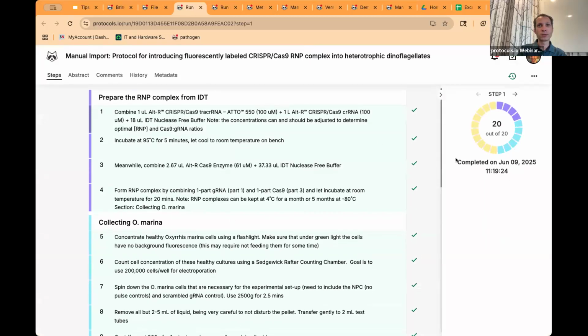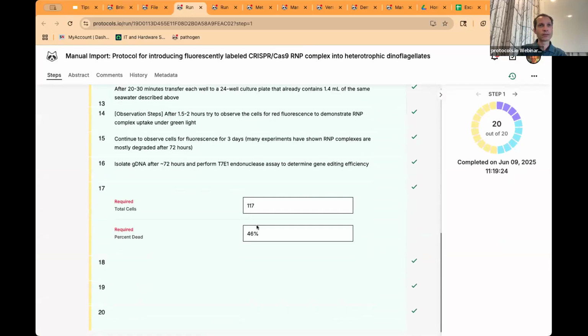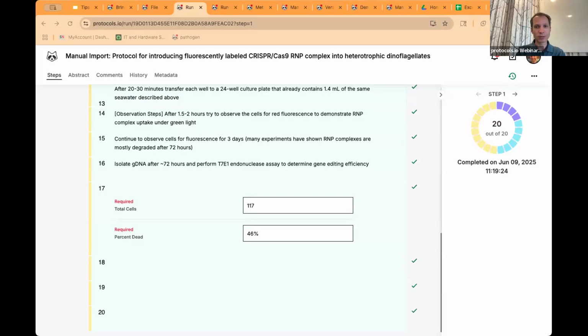So we've run it through. This is when we completed it. And the tables we can download, but not the component. I am also going to take a note of this. That's a good suggestion. We have a weekly brainstorming with our team, and I am going to bring both of these suggestions. One is for the update collection, and the other suggestion that's also really nice is CSV export of the smart component after run.